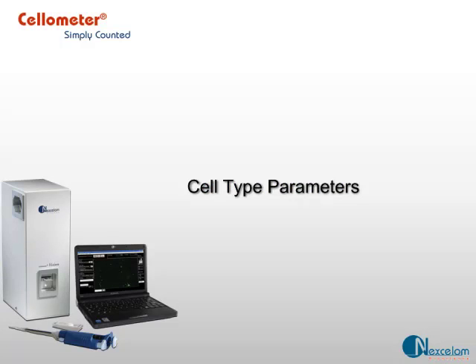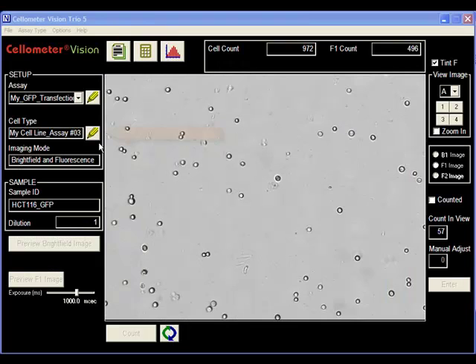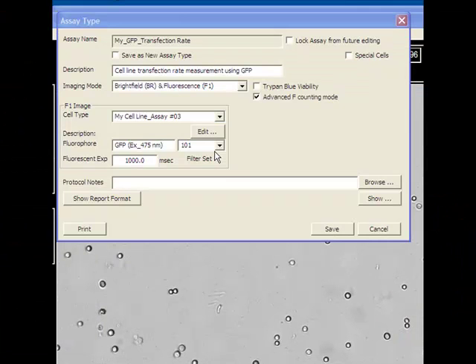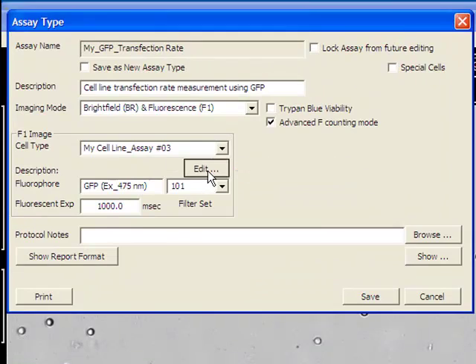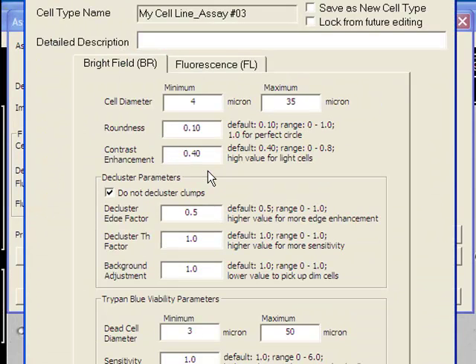You can access cell type from the Vision front panel or from assay type. Cell type controls how cell images are analyzed.